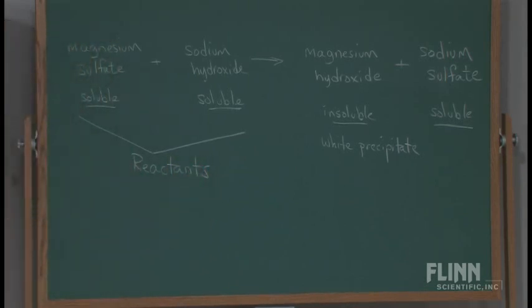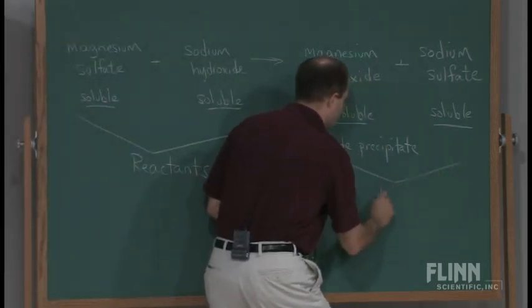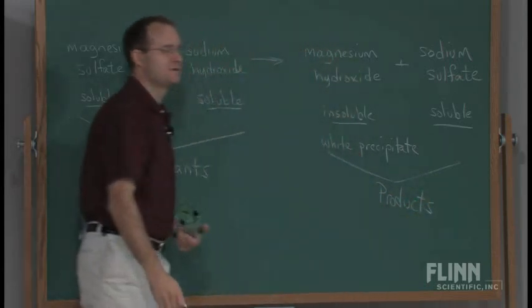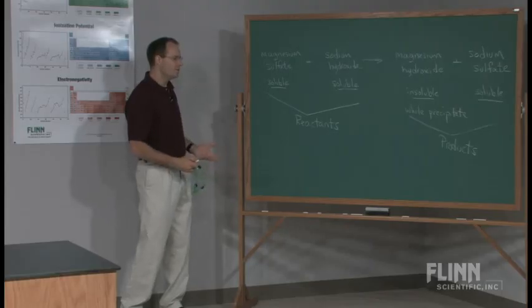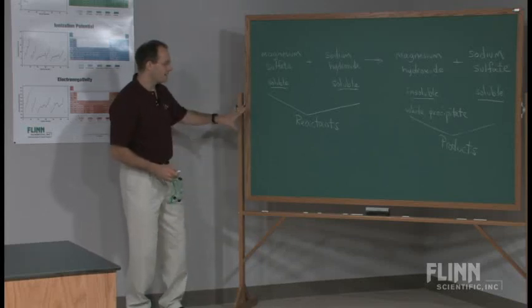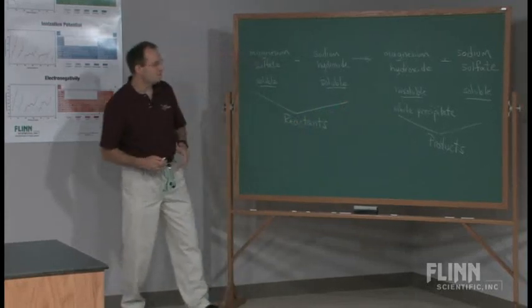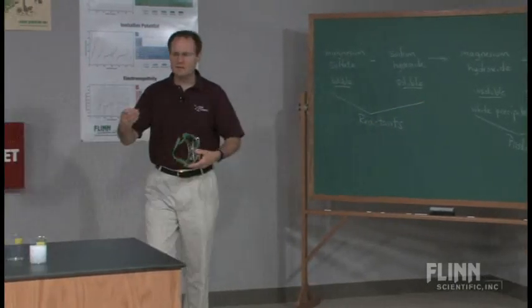Also, with this simple demonstration, we can introduce terms like reactants. We mix reactants together, and we produce products. So on the fly, if you think about it, we're showing a demonstration that can teach many, many different topics. Reactants are mixed together, they react together, and we produce new products. Well, now I want to take this a step further.